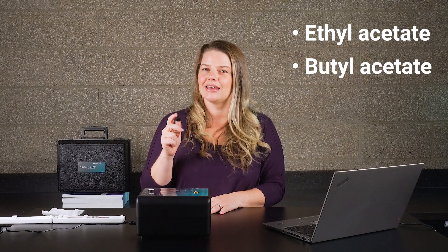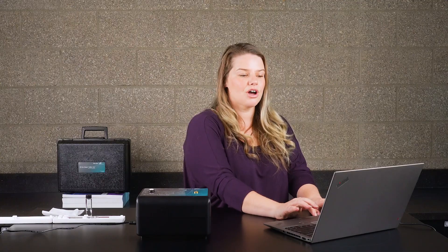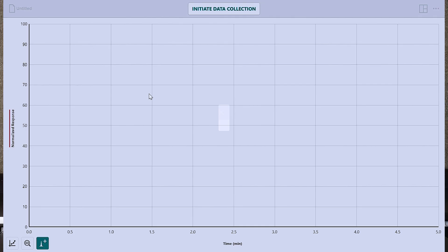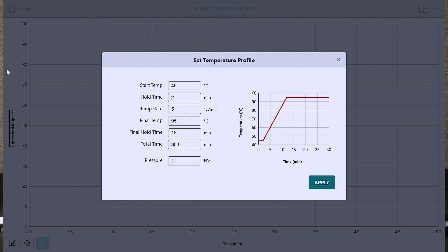Because the Mini-GC can detect both polar and non-polar compounds, let's do a separation of ethyl acetate, butyl acetate, cyclohexane, and toluene. First, I connect my Mini-GC to instrumental analysis software. I'm going to be doing the data collection via Bluetooth, but you can also connect directly via USB. I select gas chromatography, and now I'm ready to collect data. All I have to do is adjust my temperature pressure profile.